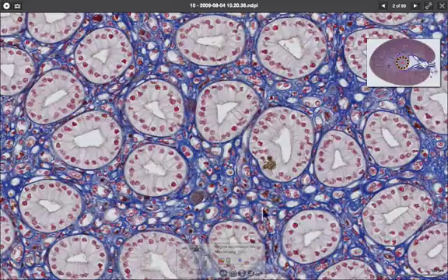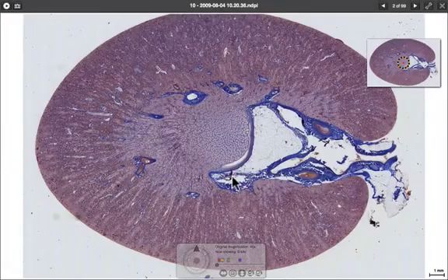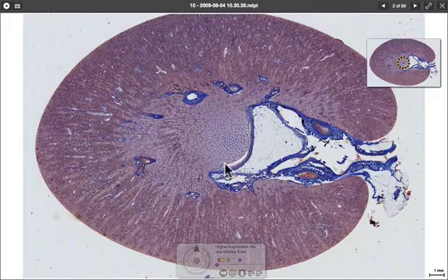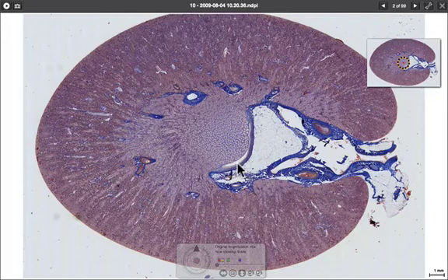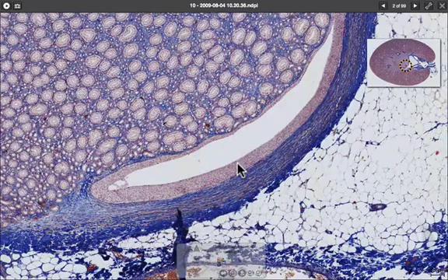Zooming back out, this long, quite flattened tube here is the ureter. Let's take a closer look at this.